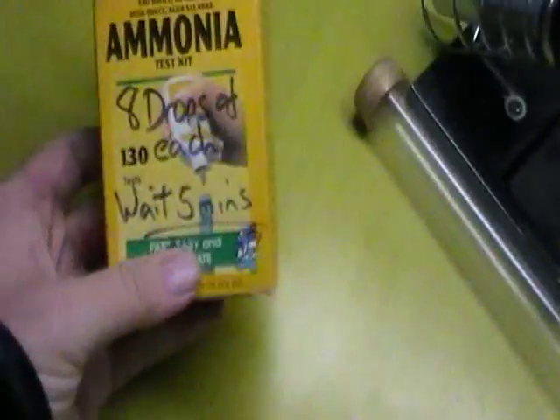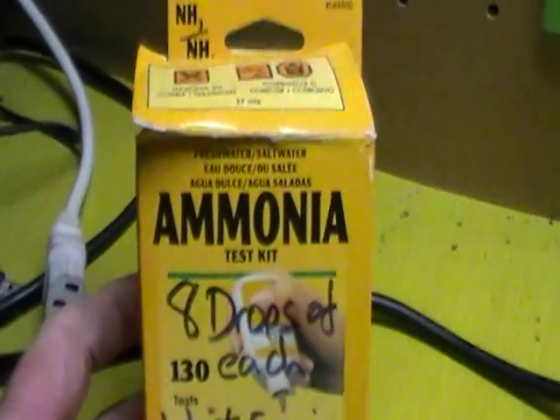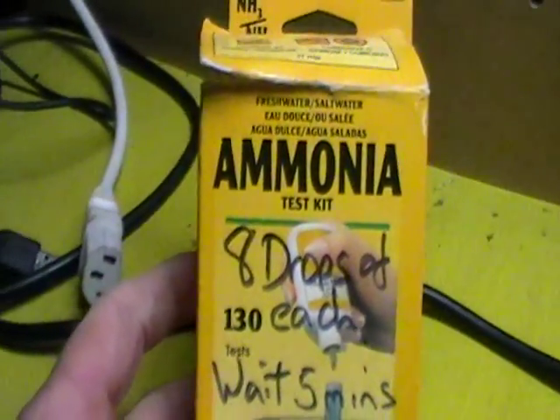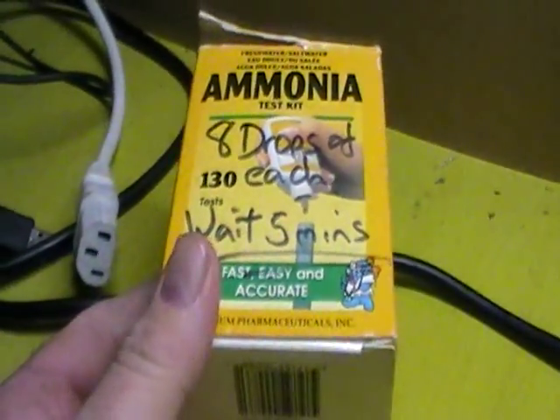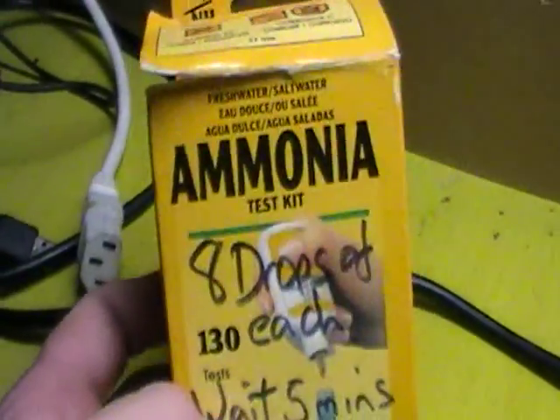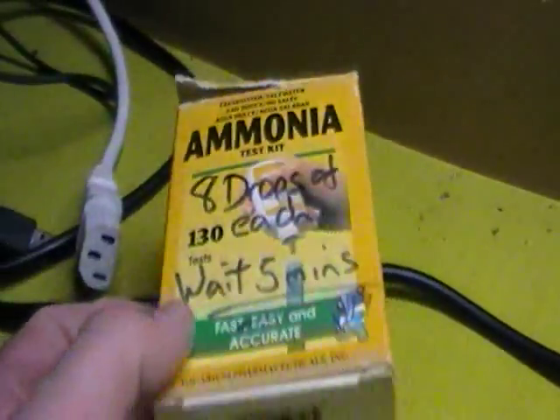So what I'm doing here, just to explain, this is an ammonia test and you must do these every now and then on your fish tanks. Not established ones necessarily, but it's a good idea to do them from time to time.